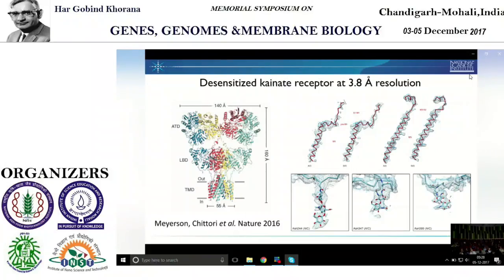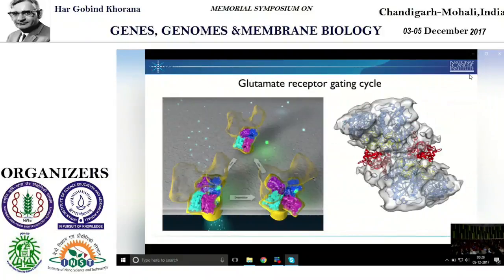And unlike crystallographic analyses, we don't need to truncate these sugars or mutate the residues, because we're just averaging the structures of the molecules. And if it's disordered, it doesn't get averaged. And whatever is ordered and close to the asparagine residue shows up in the density map.